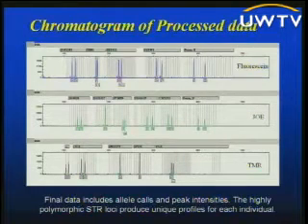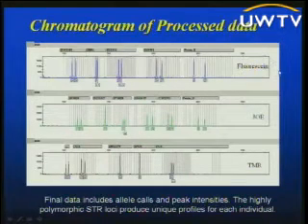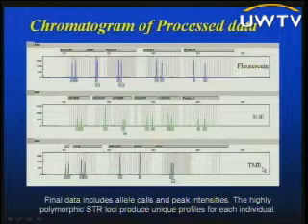Following that, you then run the products on a gel, and you have laser detection of the products, which can detect the fluorescein dye that's conjugated to the PCR products because of the primers that are conjugated to these dyes. Joe, which is a conjugate of fluorescein, or TMR, which is a derivative of rhodamine.